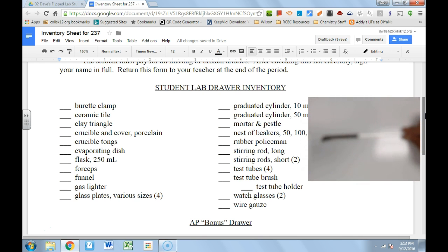We have our rubber policeman — basically a glass rod that has a rubber section on the tip. This is useful for transferring substances, maybe out of your beaker or flask, and the rubber section is useful for moving substances around. That's attached to a stirring rod — a glass rod. Those are two things.